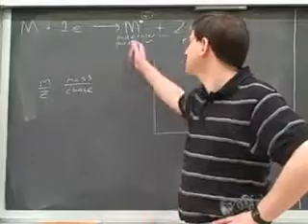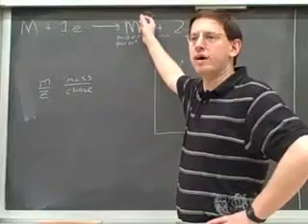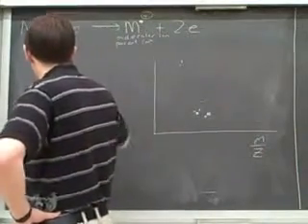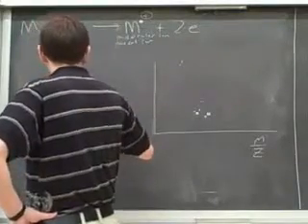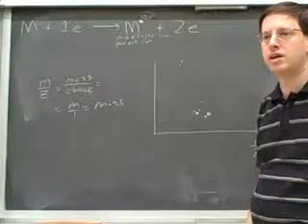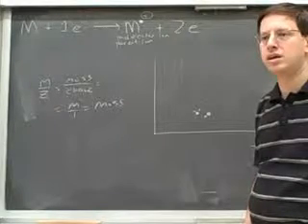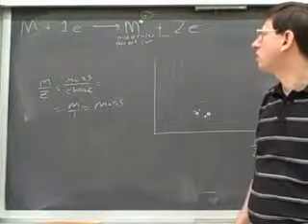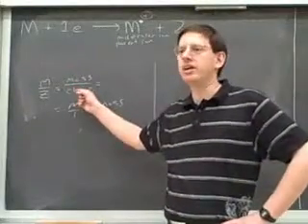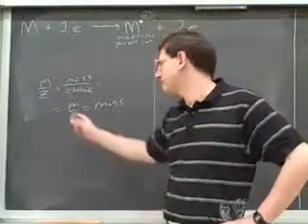But what is Z for this molecular ion? 1. It's only got one positive charge. So then the M/Z is just going to tell you the mass. And it turns out that almost all of the particles and fragments that we're going to run through the apparatus are going to have charges of 1. So even though technically speaking, the apparatus tells you M/Z, in practical terms, it basically tells you the mass.